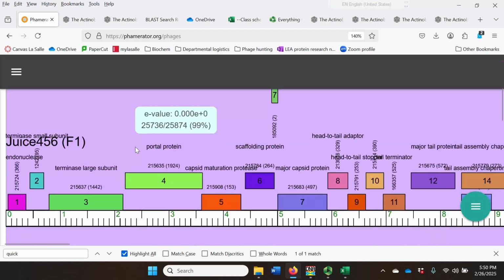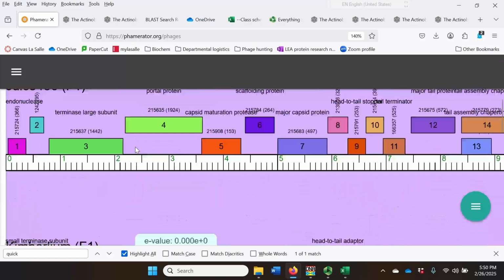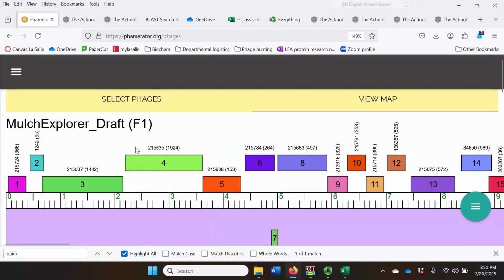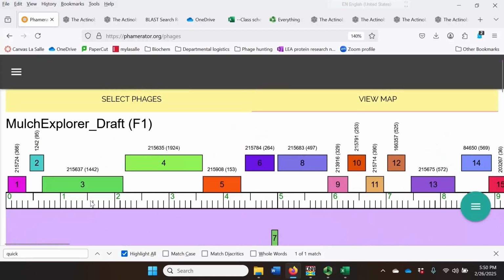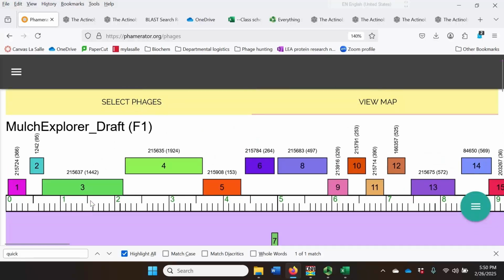And we can see that this gene is present in a lot of similar genomes. So that just gives us our bearing for what we're looking at. But now to get started with the annotation, we have a couple questions. One, do we think it's a real gene? Just the fact that we see it here in these other genomes that have already been annotated is a starting point for us to say, well, people thought it was a real gene over there, so it might still be a real gene here. We'll have to double check the coding potential when we're looking at the start sites, but for right now I think we can say, all right, it looks like we're looking at a real gene.